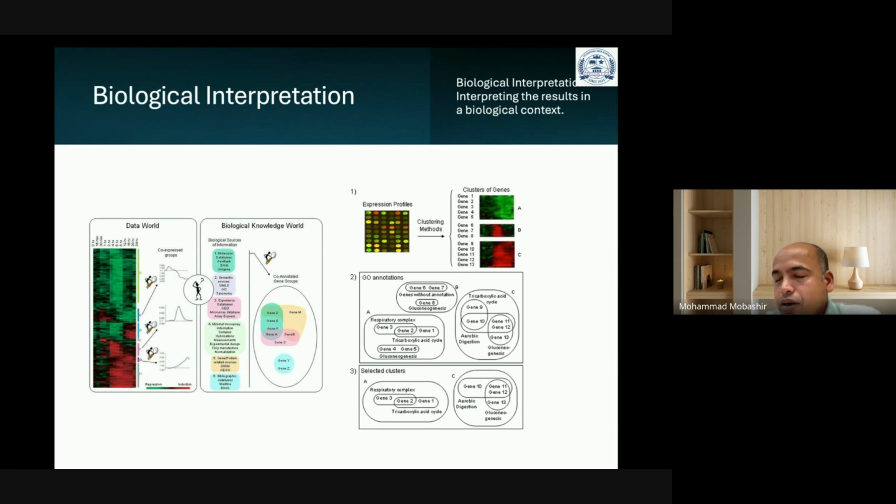And next, a part of analysis, for example, biological function analysis, you could do by using other software, for example, DAVID or EnrichNet or PANTHER databases. So this is overall, in summary, what you could do for microarray analysis.